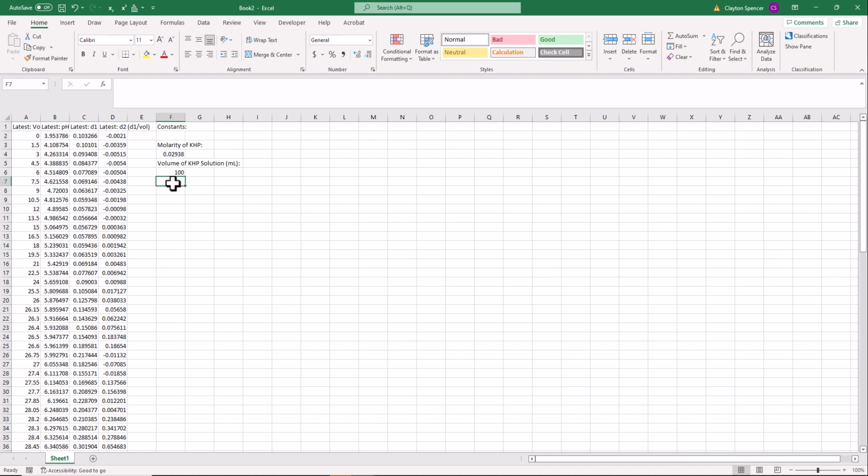So some other constants that we need. The molarity of the sodium hydroxide solution. That was 0.1 molar. It had several zeros in it, which we don't really need to enter, but that's okay. And then we need the theoretical equivalence point, and again, that'll be in milliliters. Based on my molarity, that theoretical equivalence point was 29.38 milliliters. This is the one that you calculated early on.